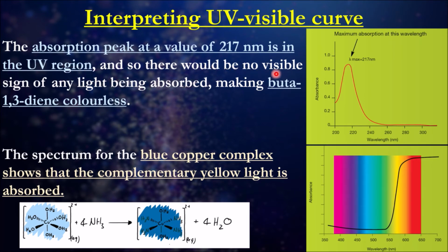So that means that any light that's coming through would not be visible to a normal colorimeter, but for our particular apparatus here, it can detect that. I also forgot to say, this also explains why the compound would be colorless. As you can see, the wavelengths of colors aren't existent there. So that's one of the applications of using UV, because we can see absorbance that wouldn't normally occur if it was in the visible spectra.